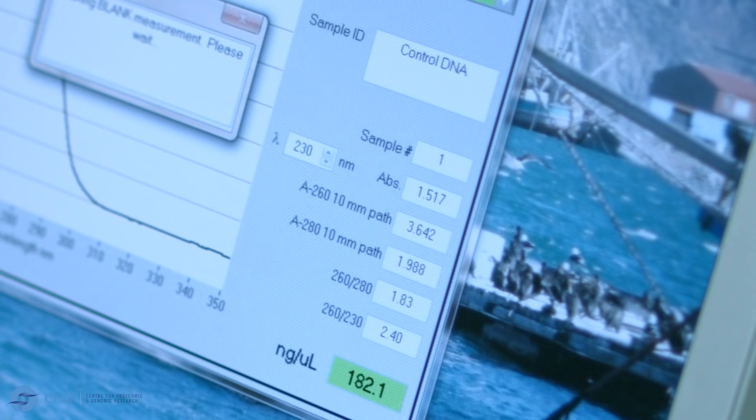Turn on the PCR hood or laminar flow at least 5 minutes before starting. Aliquot the same volume of DNA across the plate. The positions of each DNA sample has to be recorded accurately using a sample recording template containing a plate layout.